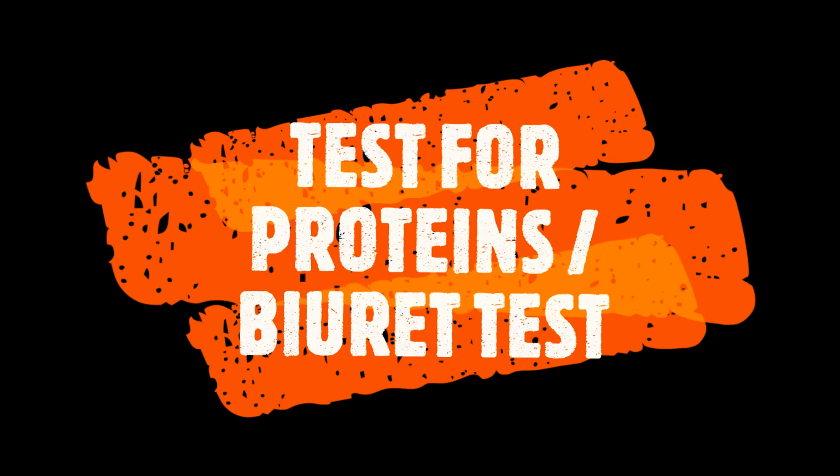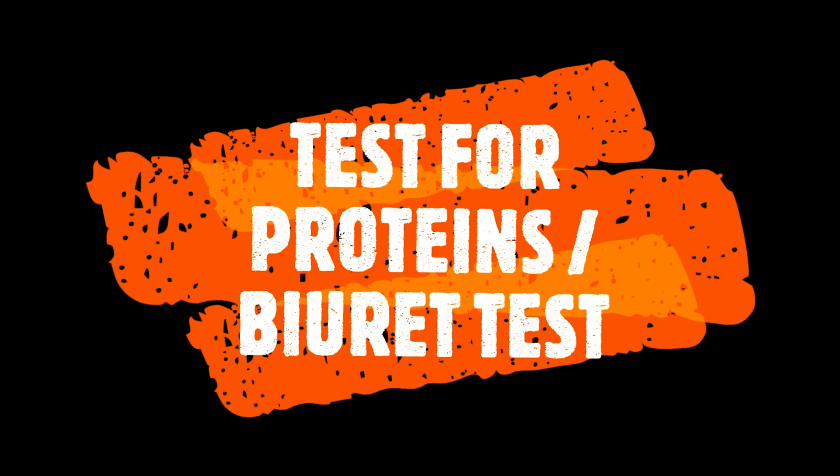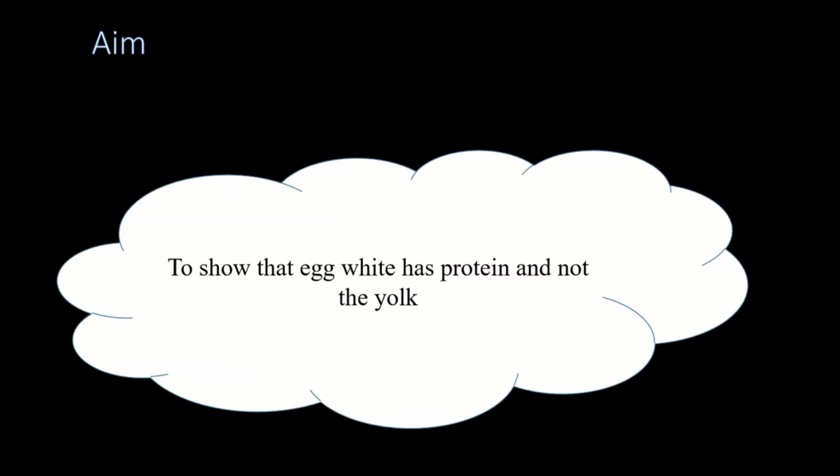Our lesson for today is test for proteins, or rather we are doing a biuret test. Now what we want to achieve by the end of this lesson is that we want to show that egg white has protein, whereas our egg yolk does not have protein.